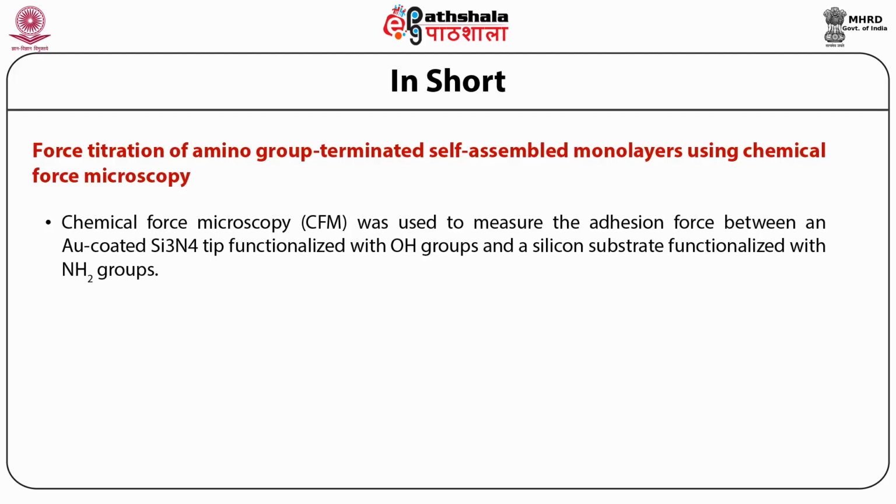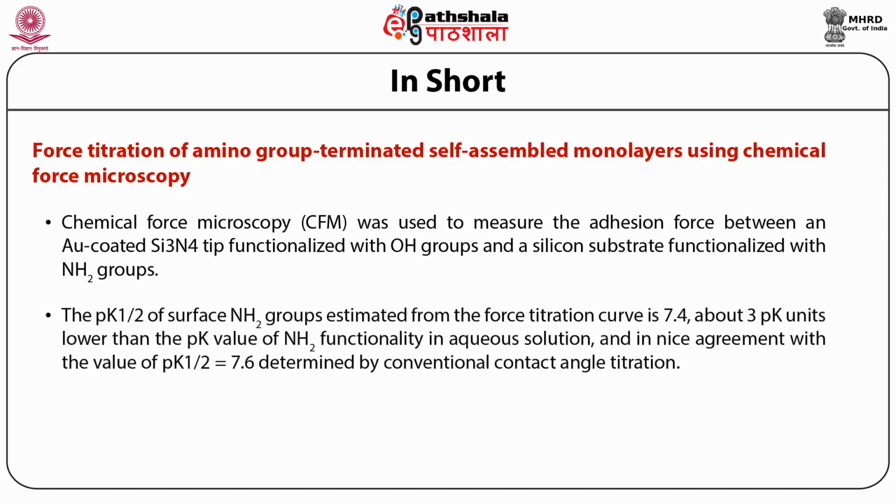The curve of the adhesion force as a function of the solution pH value, the force titration curve, was obtained. The pK half of surface NH2 groups estimated from the force titration curve is 7.4, about 3 pK units lower than the pK values for NH2 functionality in aqueous solution, and in nice agreement with the value of pK half equivalent to 7.6 determined by conventional contact angle titration.